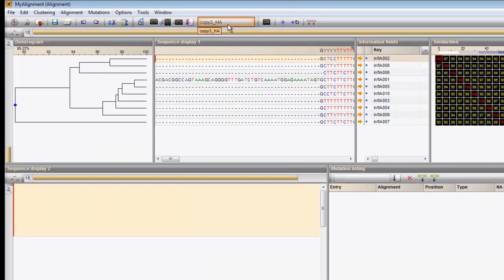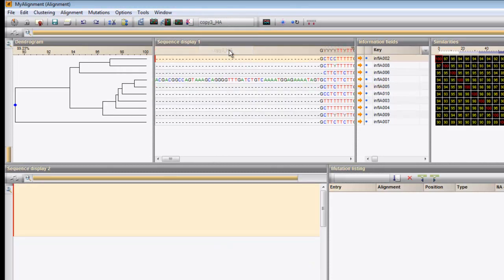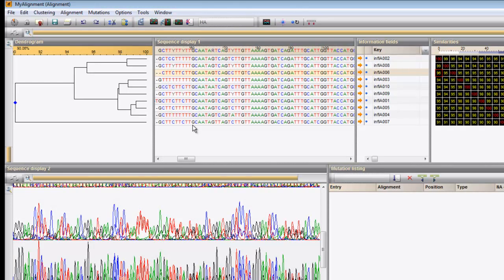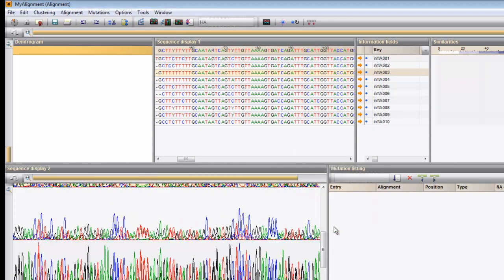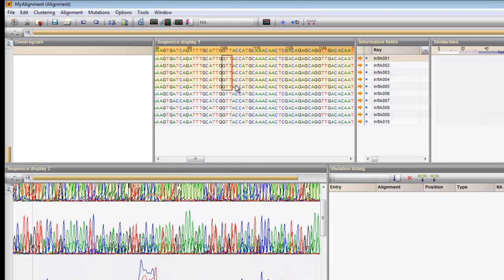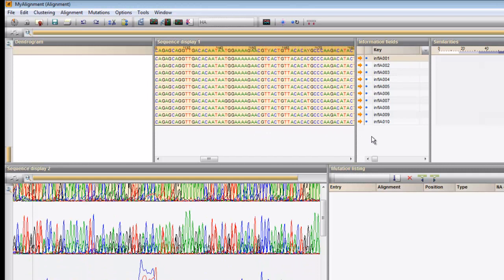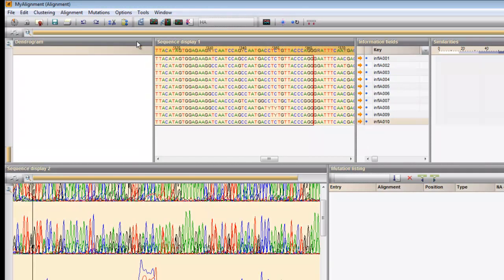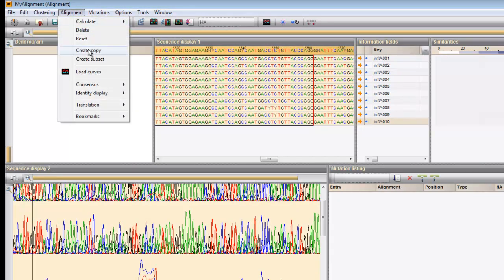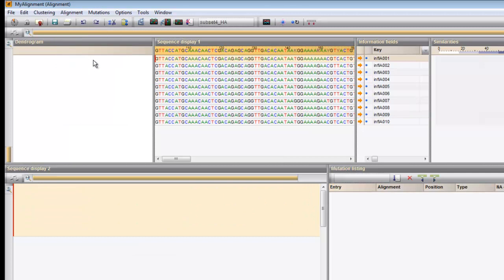The active alignment can be selected from the drop-down list in the main toolbar. When a consensus is present, it can be used to align other sequences against it using this button. Sometimes you are specifically interested in a certain region within an existing alignment — it is possible to create a new alignment containing only this specific region. Select a region of interest and choose Alignment > Create Subset.